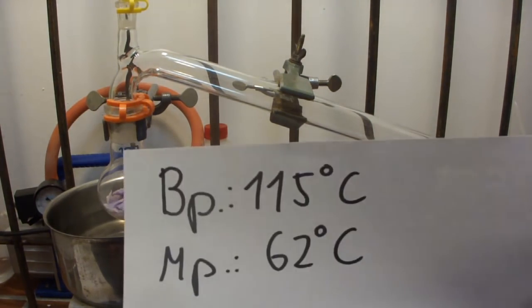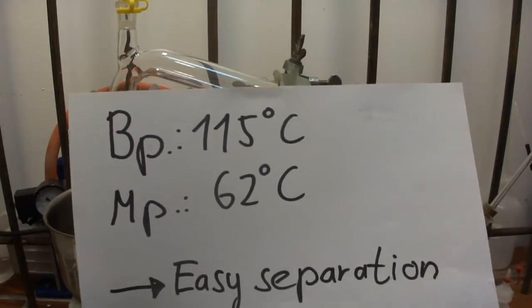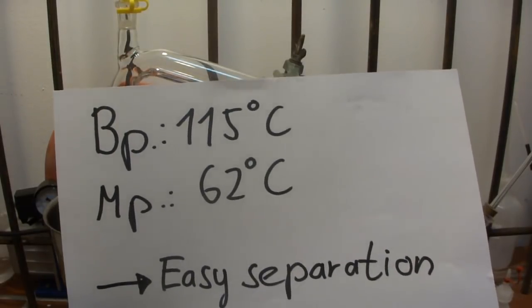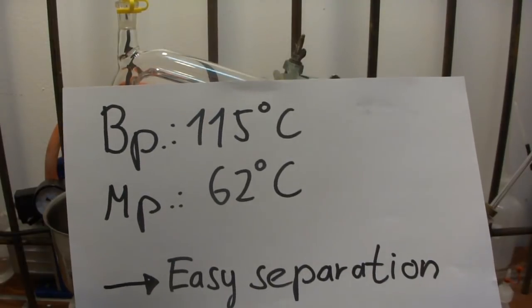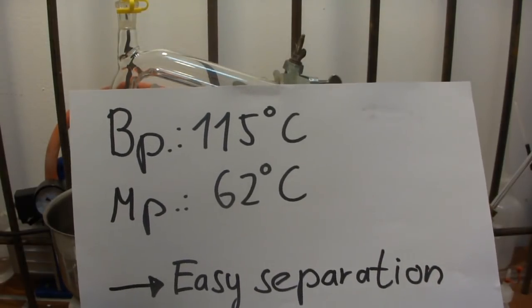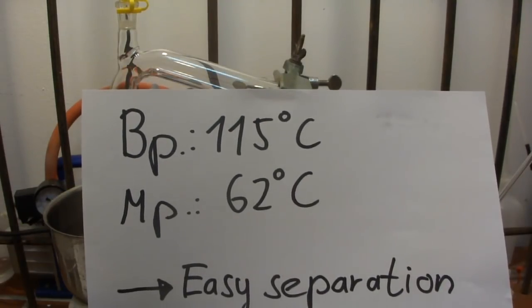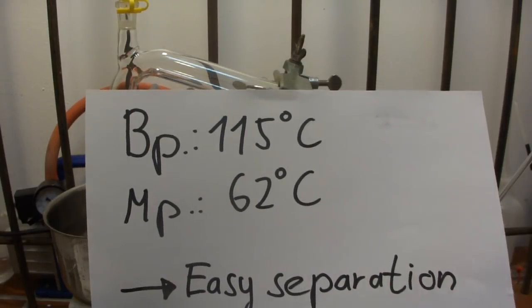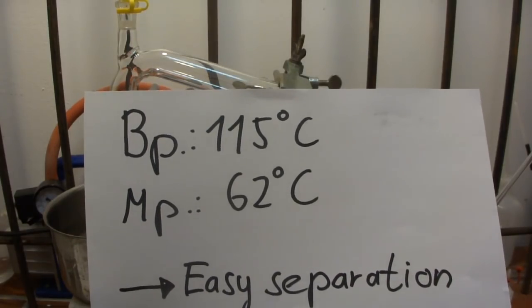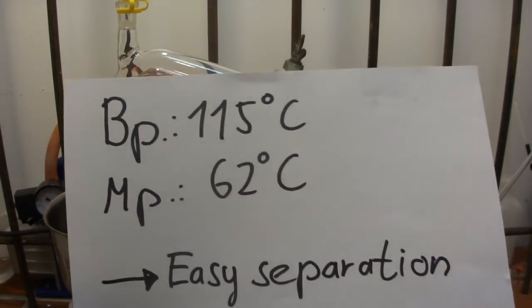So we have decided to do it by simple distillation. So the boiling point of trioxane would be 115 degrees centigrade and its melting point would be 62 degrees centigrade. So it is not really a normal distillation, but it is very easy to separate trioxane from methylene blue and magnesium stearate in this way, since both compounds are salts and non-volatile.